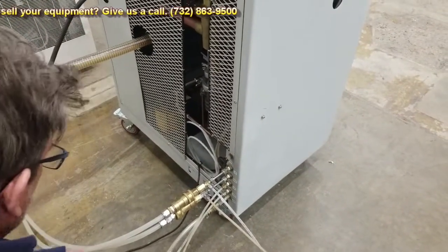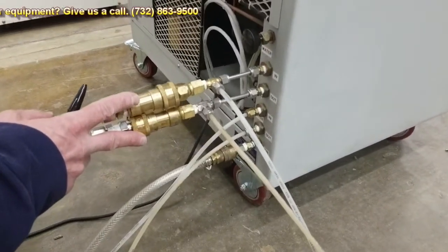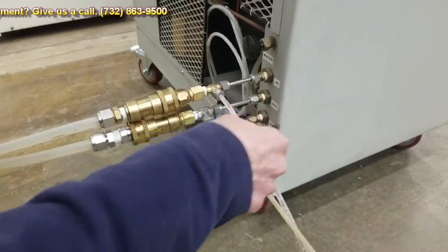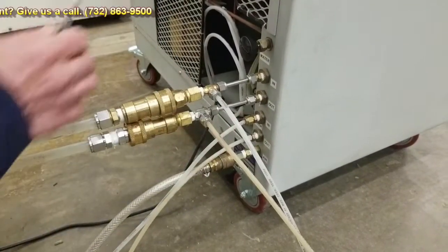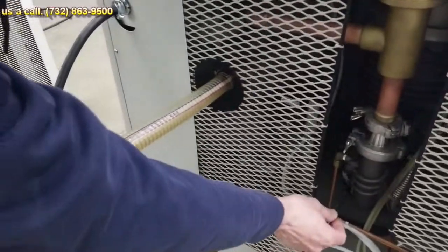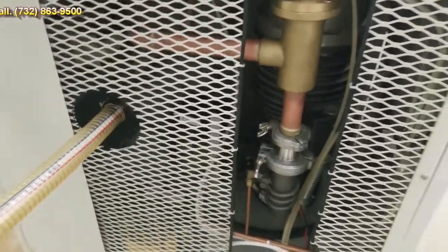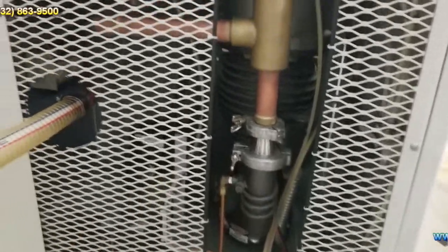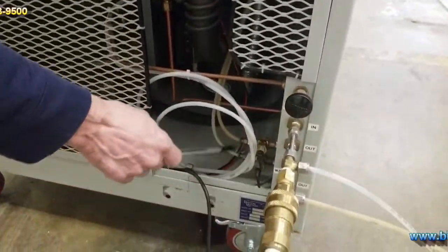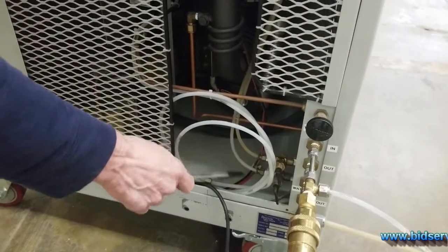While we're back here I'll explain some of the utilities. We have water coming in from a chiller and it's teed off, so you have two ins and two outs. One of the ins is for the diffusion pump — there's your Varian diffusion pump. Two of the lines go into the diffusion pump; the other two come down here for the radiant cooling on top.